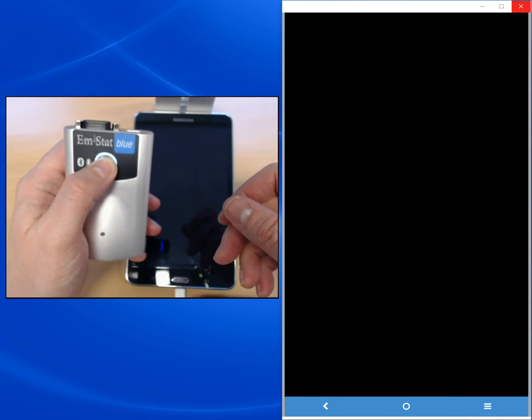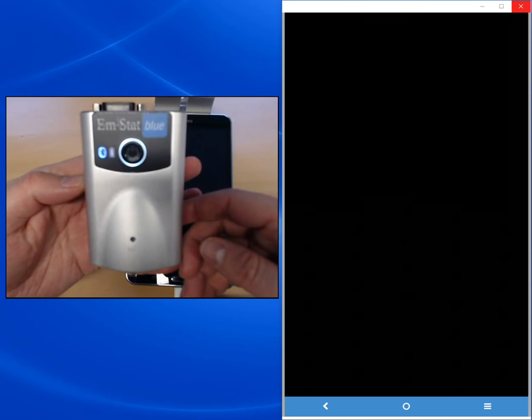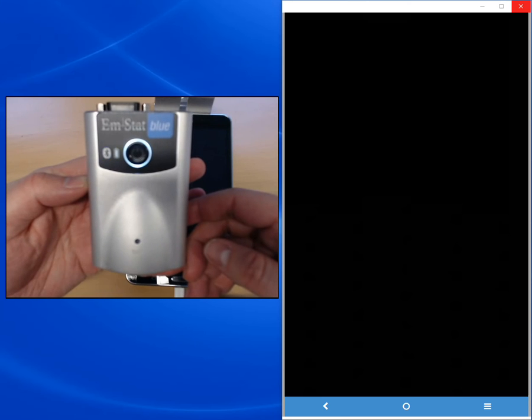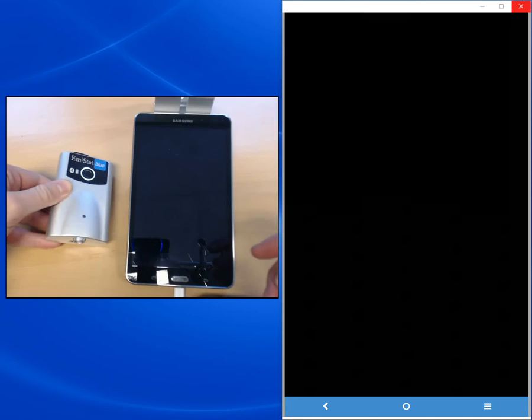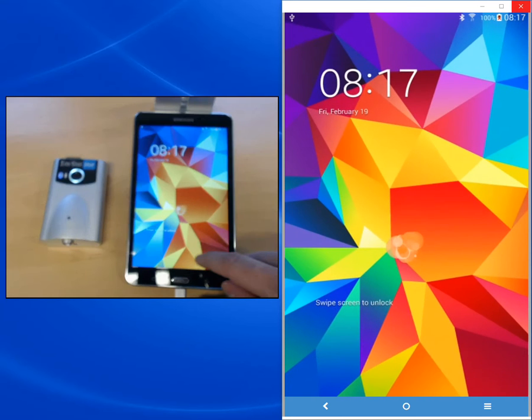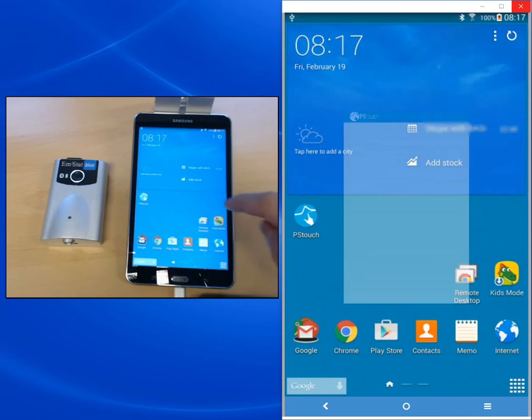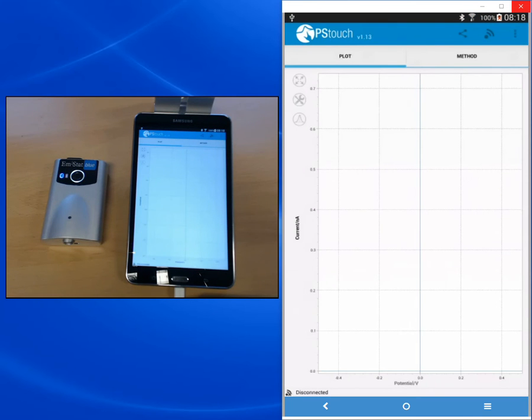When you switch the EmStat Blue on, you can see that it's on with an illuminated circle, and you see a blinking blue LED indicating that the Bluetooth connection is ready but not yet connected to another device. For this demonstration I'm using a Samsung Galaxy Tab with a 7-inch screen. I switch on and open PS-Touch. After I open PS-Touch I need to connect my device, so I press the connect button which is in the top right corner next to the menu button.